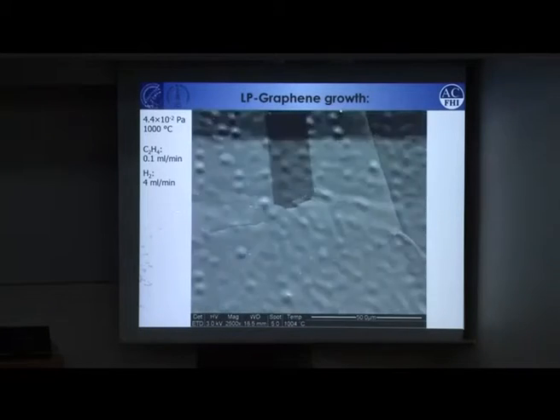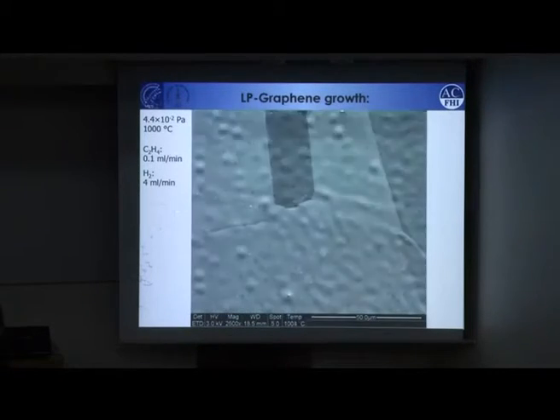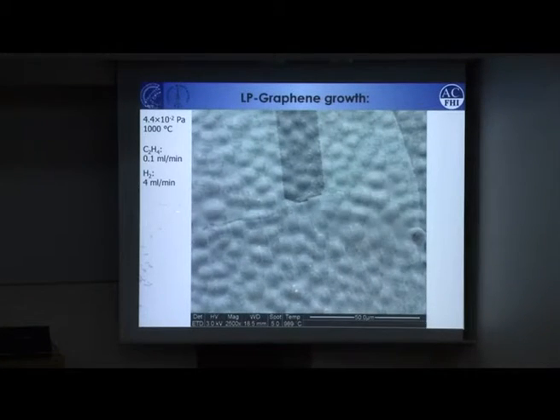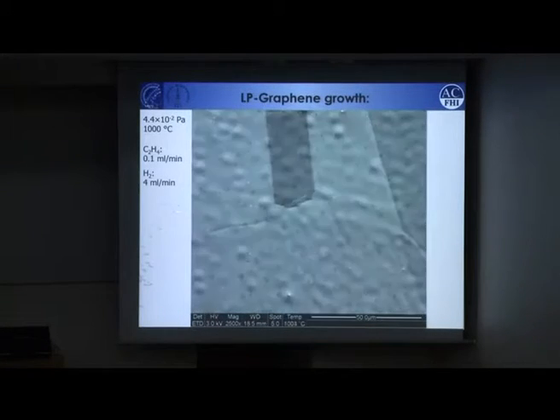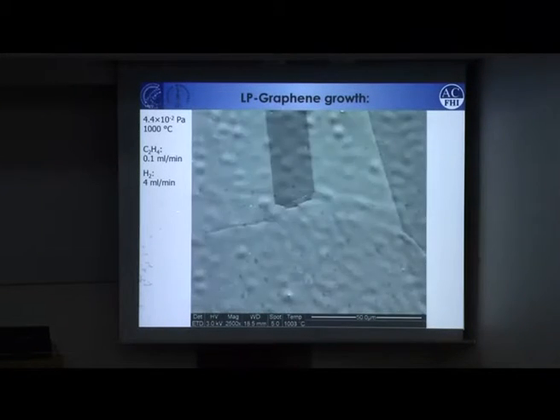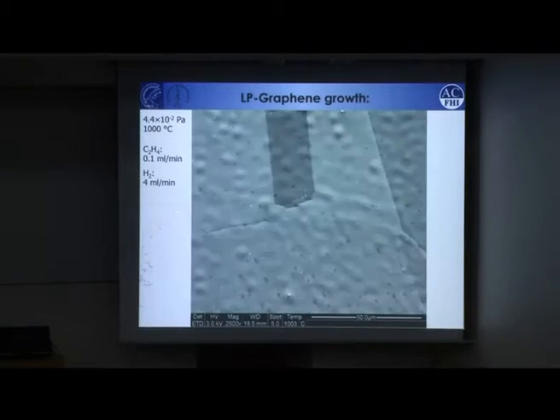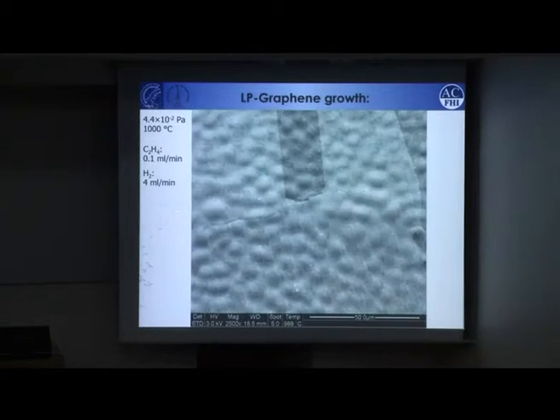It's as bright as a light bulb inside the microscope. And we're looking at the secondary electron detector in the SEM, and we see the formation of, in this case, really single atomic layers of carbon. So it's giant. At the beginning, I didn't believe that we would be able to see that, but the graphene offers such a good contrast in the secondary electron microscope that you can actually see it.